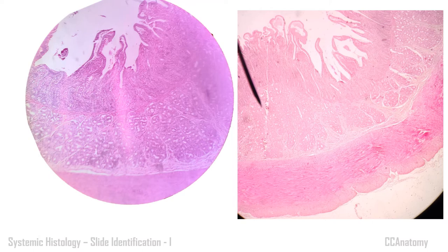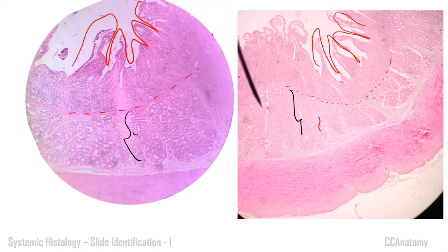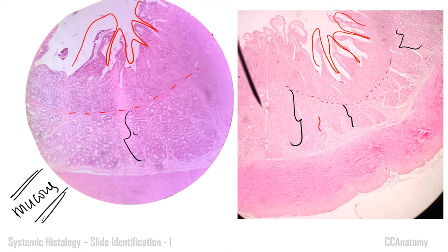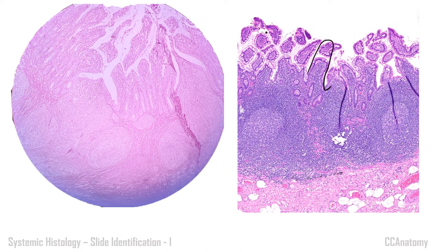Try to differentiate villi from crypts in this slide. Yes, these are all villi — you can make out the different projections. Here you can see the muscularis mucosae. Below the muscularis mucosae, this complete region contains the submucosal glands — Brunner's glands — which are mucous in nature. Due to faint staining, the glands may not be seen clearly, but villi with glands in the submucosa means you can easily label this as duodenum.